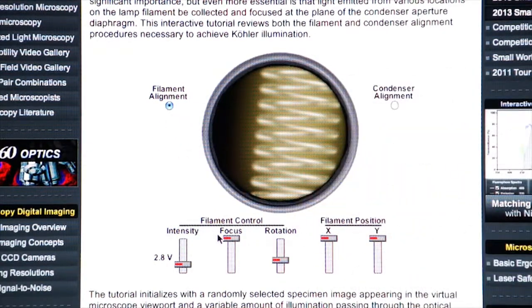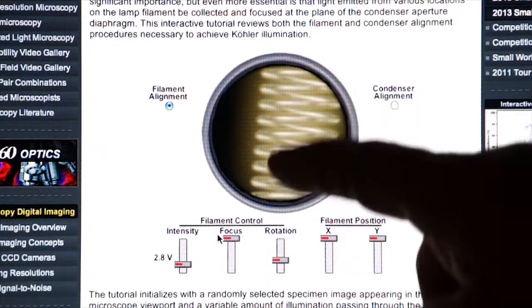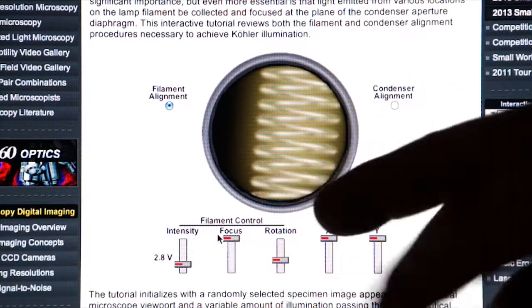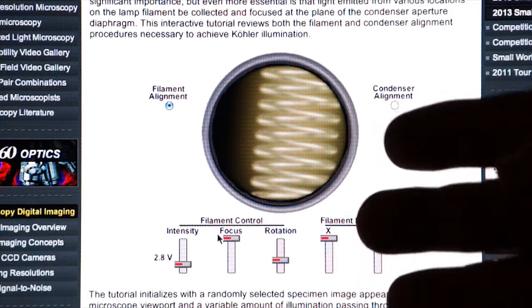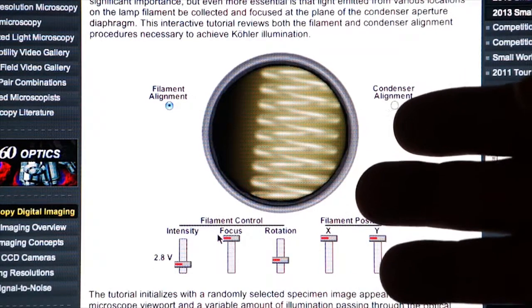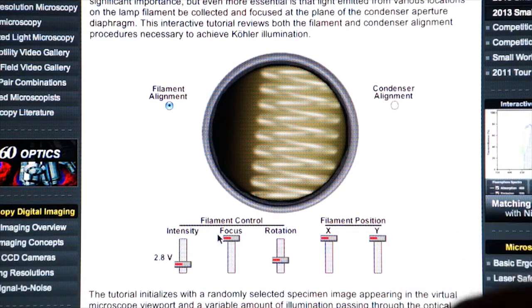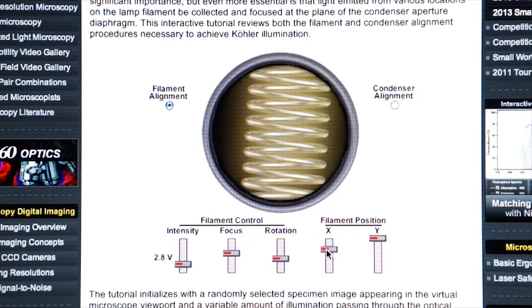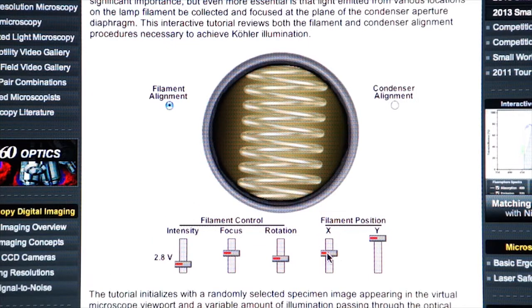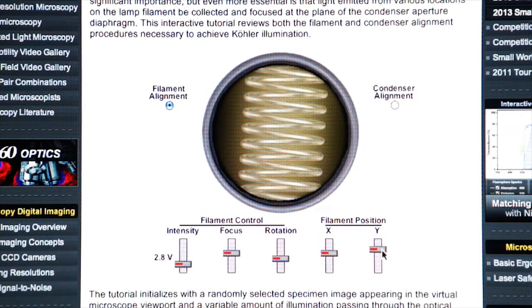So let's go through this tutorial. Here you see the actual filament which shows up in the field of view. Now in modern microscopes, it's not as important to do this because the modern bulbs are already pre-centered. But what we can do is focus on the filament, make sure it's nice and sharp, rotate it, and align it in X and Y so that it's fully aligned to the center of the microscope.